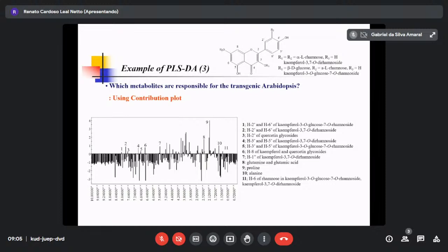In animal cases, for example, you have samples 1, 2, 3, 4, 5, 6, 7. You can name them with sample codes 1, 2, 3, 4, up to 100. But numbers 1 to 10 are transgenic, 11 to 20 are wild type. Now if you separate them into transgenic and wild type, there are two reasons for differences. One is because of genes. The second is because of the order of samples, because who knows, in the first 10 samples the temperature is stable, and the next samples are not stable.